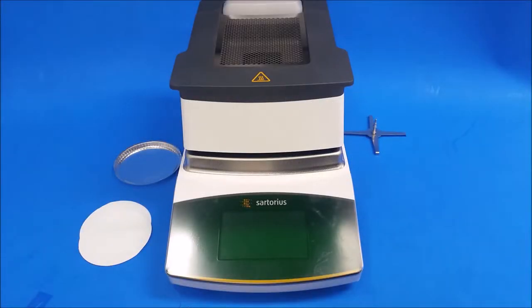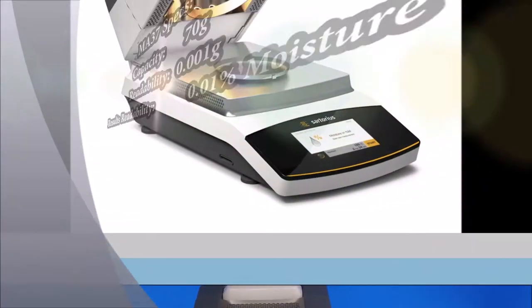Hello everybody, DSCGuy here today. Today I'm going to show you how to run a test on your Sartorius MA160, and if you have an MA37, this video will work for you how to run a test as well.